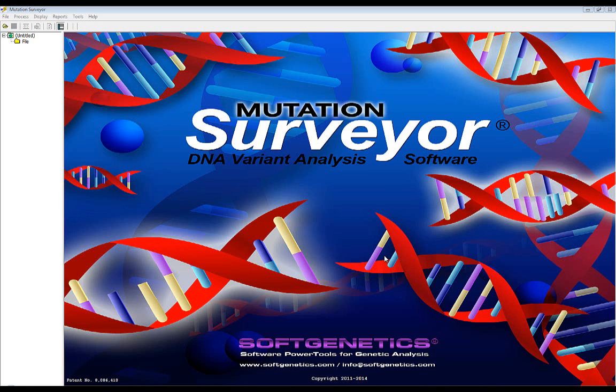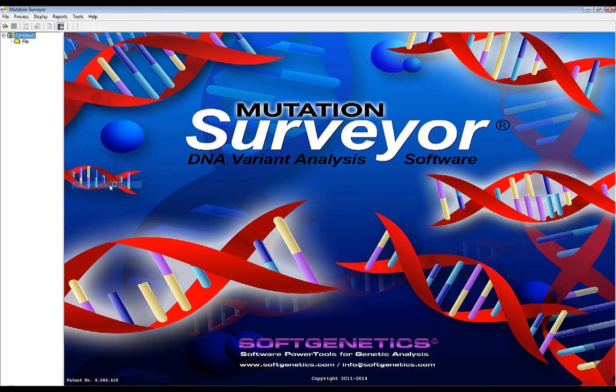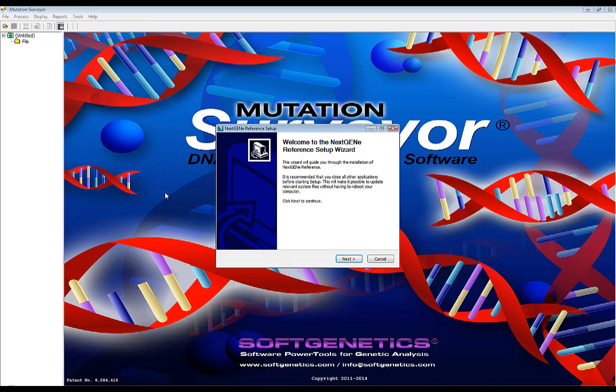To import database annotation into Mutation Surveyor, a whole human genome reference must be downloaded and saved on your computer. To start the download, navigate to the Tools menu at the top of the screen and select Import Reference to open the Import Reference wizard. This wizard will guide you through the download process, but if you have any questions, please contact us by telephone or send an email to tech_support@softgenetics.com.